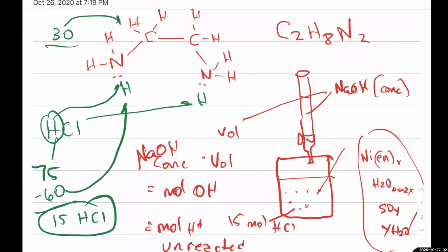So do you understand that? You're adding HCl, it's in excess. Some of it goes unreacted. What you are doing is titrating that excess that went unreacted to the equivalence point. The key here is that you are titrating the excess unreacted hydrochloric acid. So when you reach the endpoint, the moles of the hydroxide is equal to the excess hydrochloric acid that went unreacted.